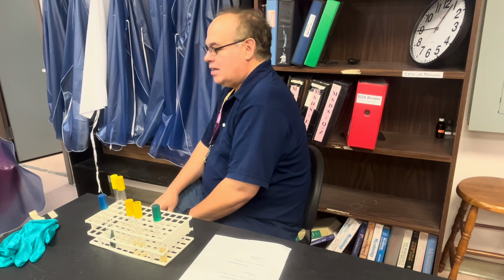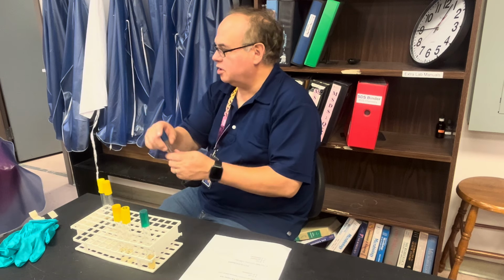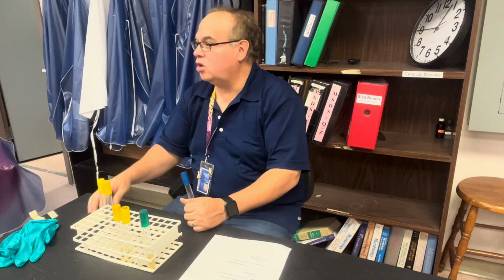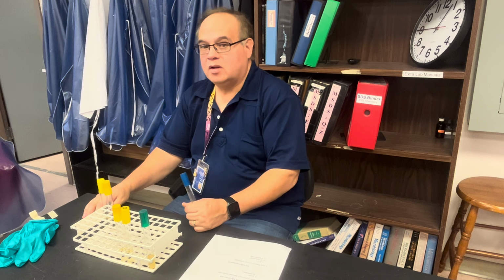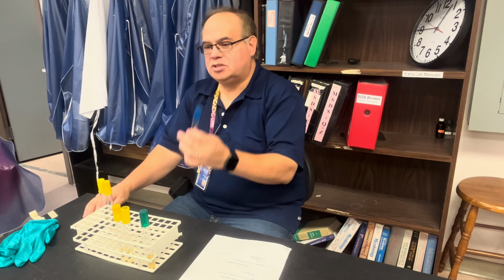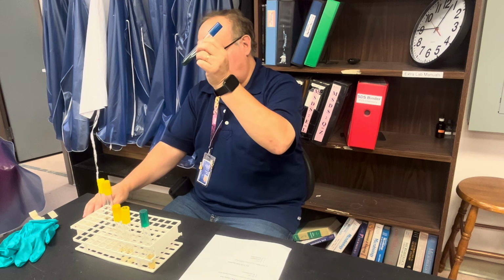Okay. Then the last test is the easiest one of them all. Does anybody have a needle close by that I can borrow? Will you grab a needle for me, please? Thank you. So this is called citrate agar.